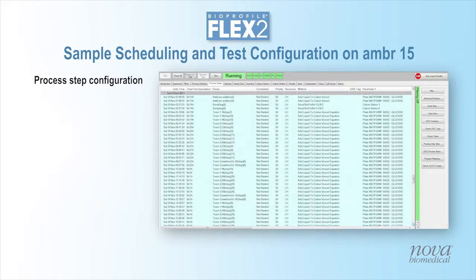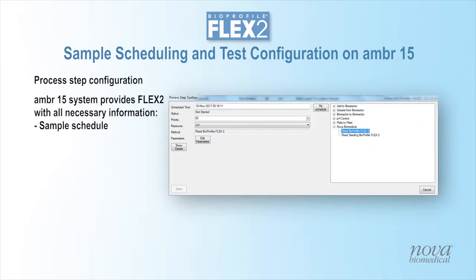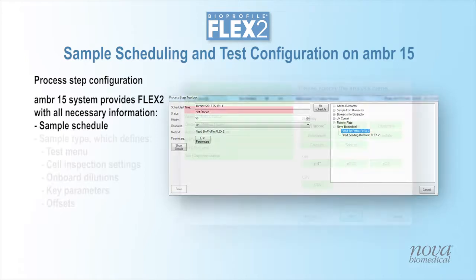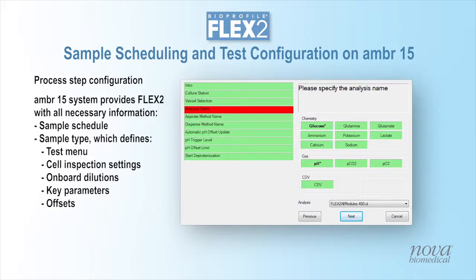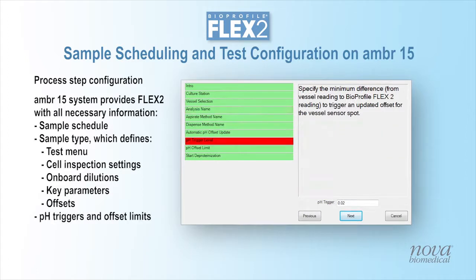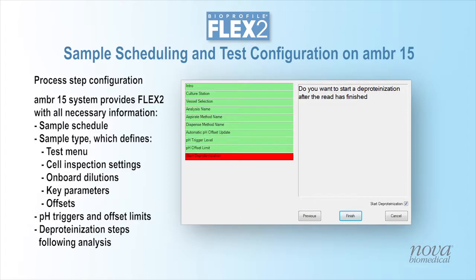Sample scheduling and test configuration are performed via the ambr 15 user interface. New process steps can be created or existing process steps modified to schedule sampling of each micro-bioreactor followed by analysis by the Flex2. Process step configuration includes sample scheduling, selection of the sample type which defines the test menu, cell inspection settings, onboard dilutions, key parameters and parameter offsets, as well as pH trigger points and offset limits, and deproteinization steps following analysis.